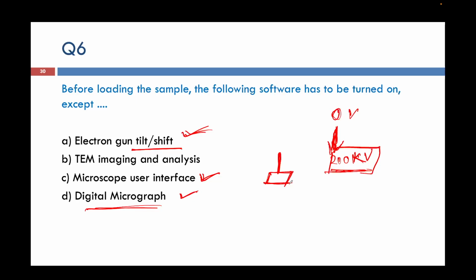There will be no astigmatism, no shifting of our electrons, no wobbling, and no other effects associated with the beam and specimen interaction. We minimize those things, and then finally we prepare our sample.